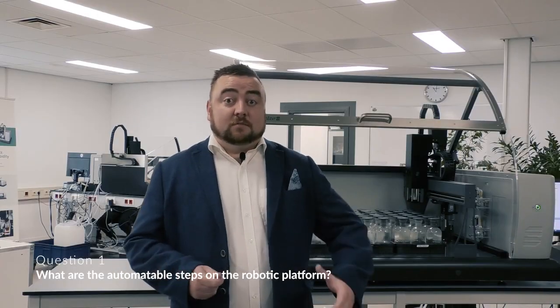So keeping in mind that within the theme of automation there are of course different levels of automation, semi-automation all the way up to say total automation. So number 1, dilution water addition. This is based on the idea that the operators have manually pipetted the samples into the dilution bottles themselves. So number 2, sample pipetting and transport.